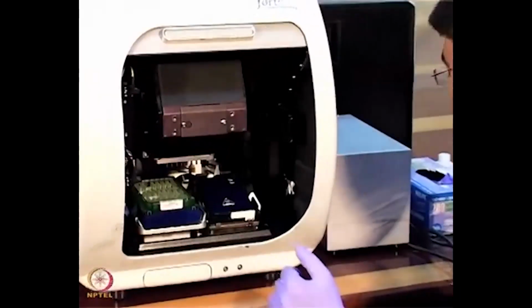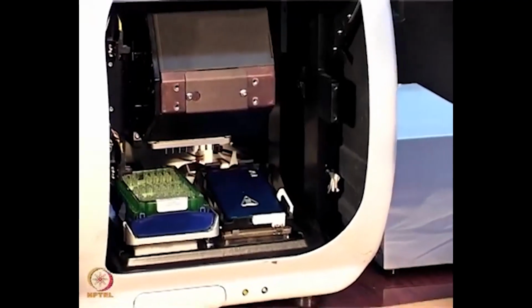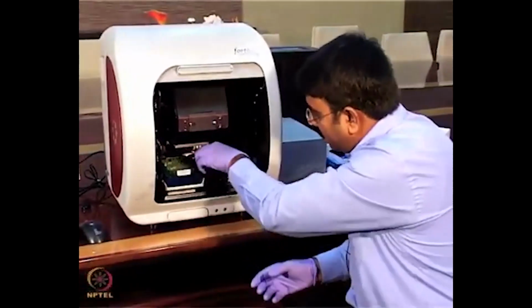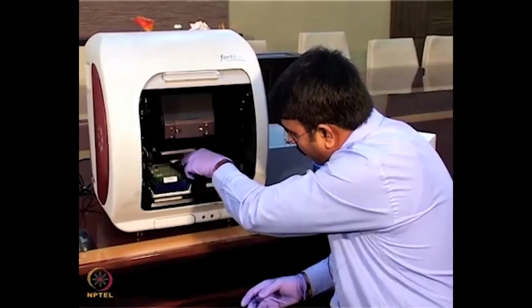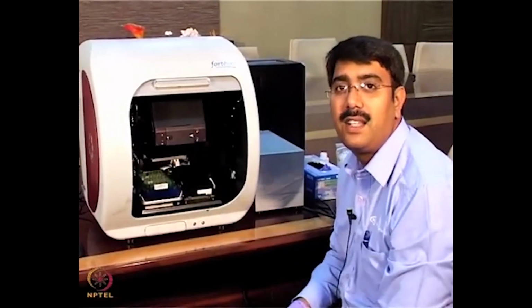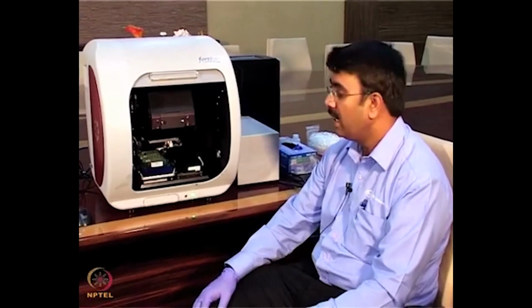and then we can put in the samples. So this is the 96-well plate format. We can analyze 96 samples in one go. This works on the principle of dip and read as well as Bio-Layer Interferometry. You know about the principle behind Bio-Layer Interferometry from the last talk.